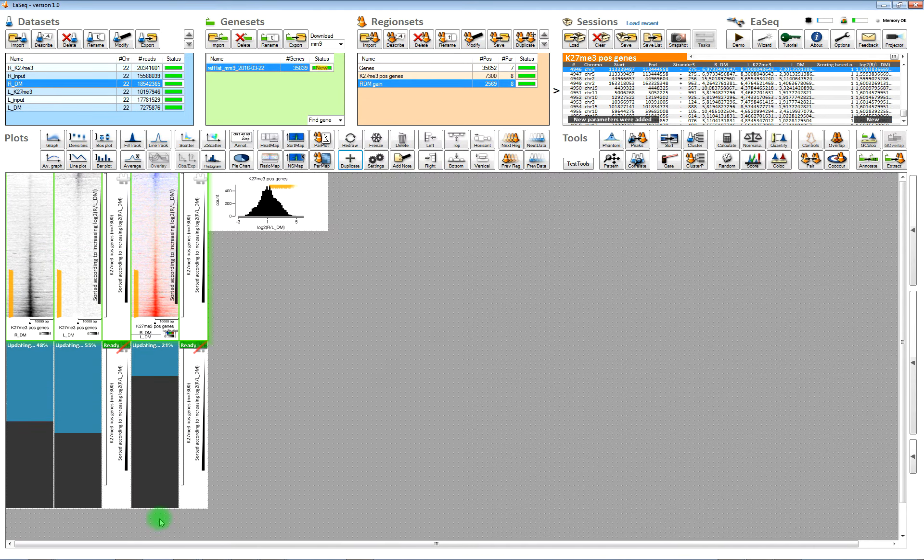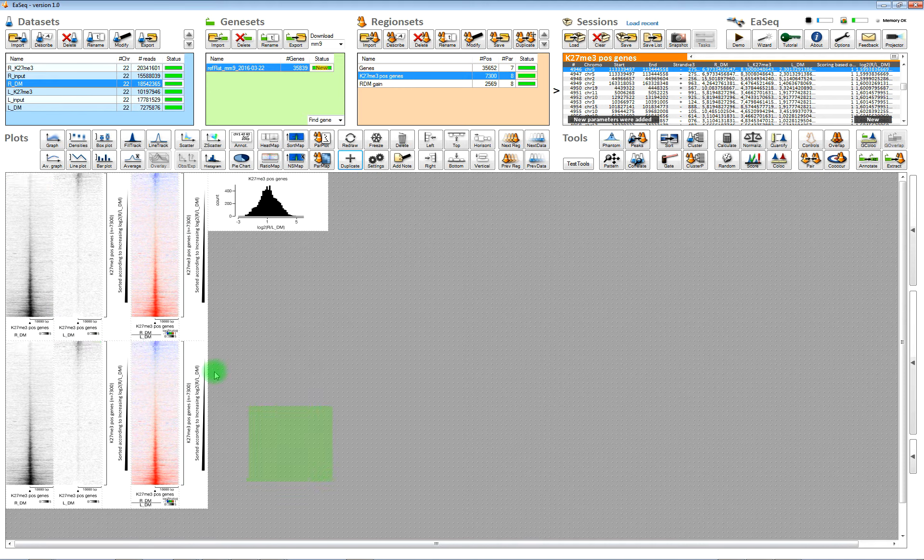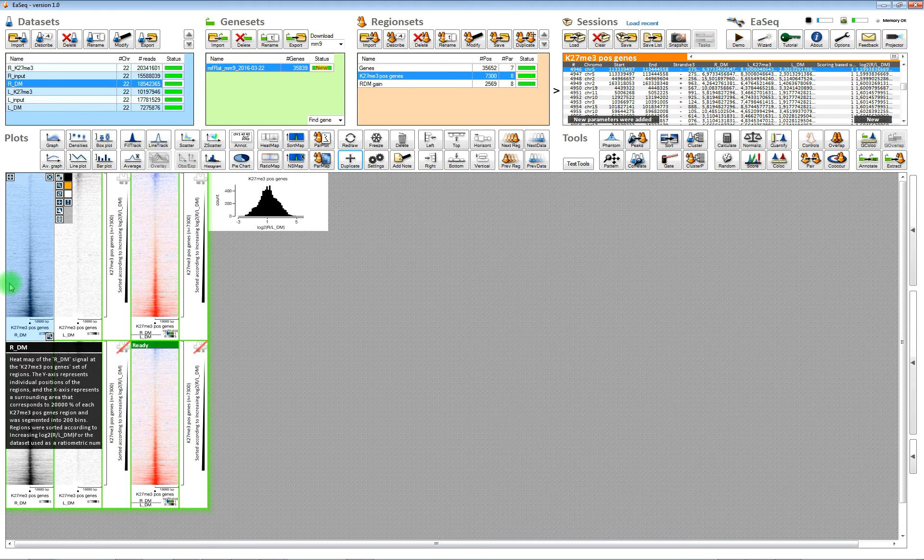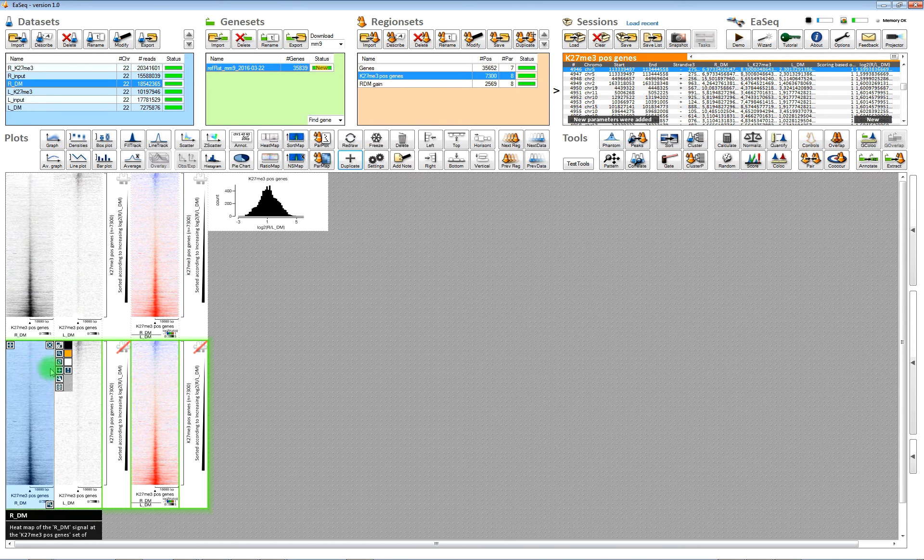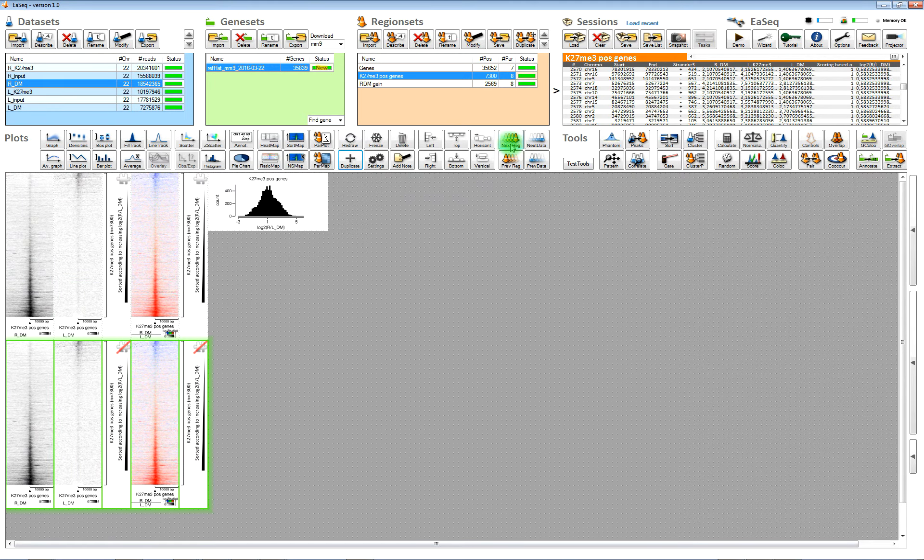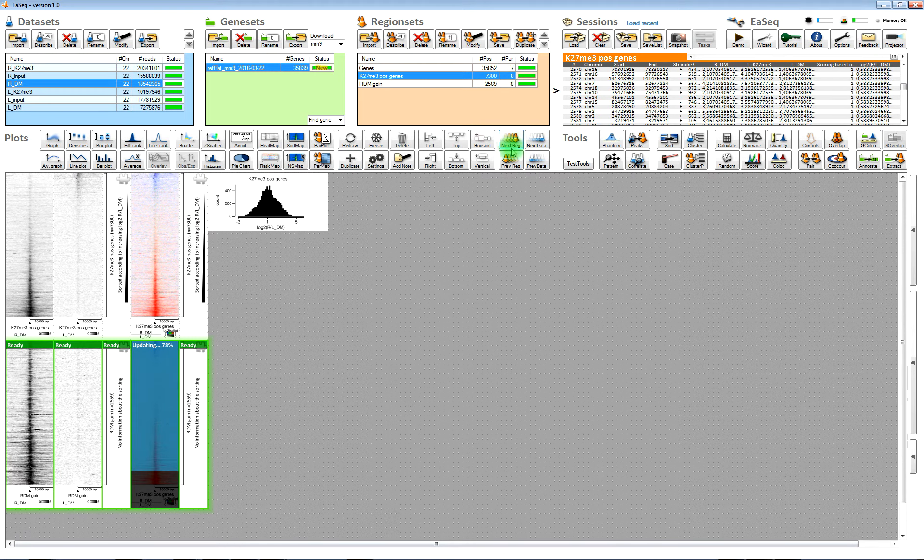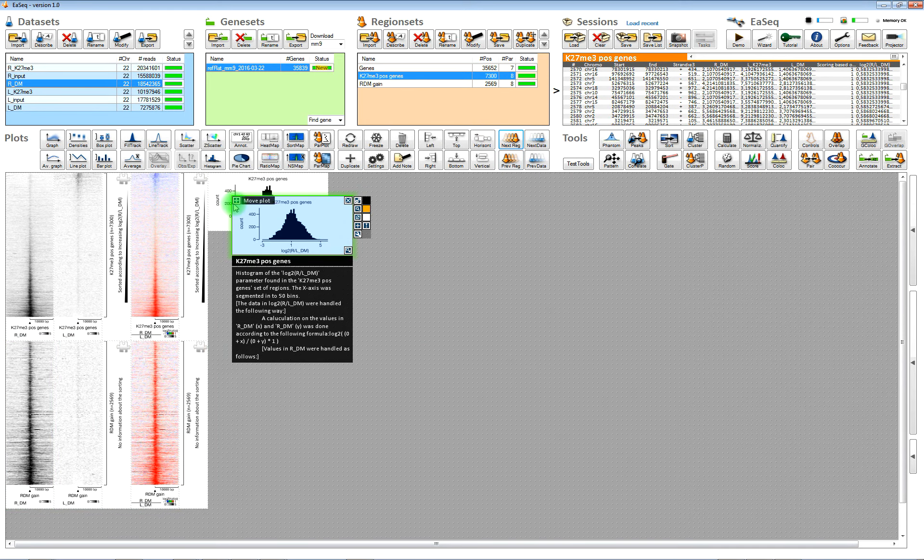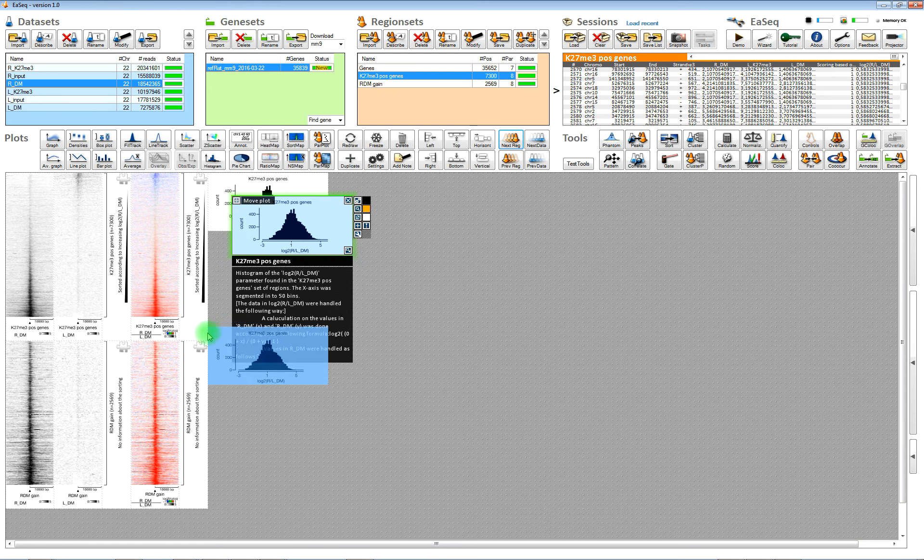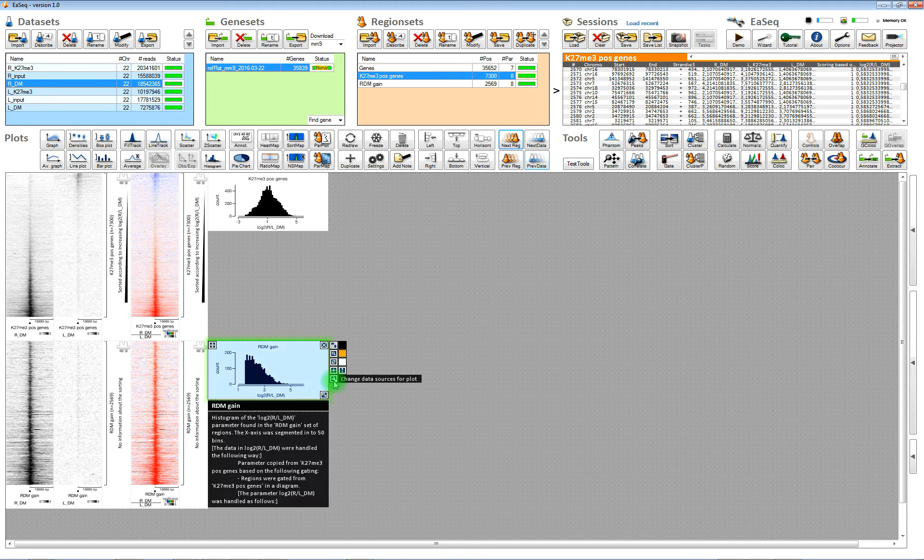And if we duplicate the plots, then we can change the regions that they are showing by a single click. And now they are showing the new regions we gated out. And we can do the same for the heat map.